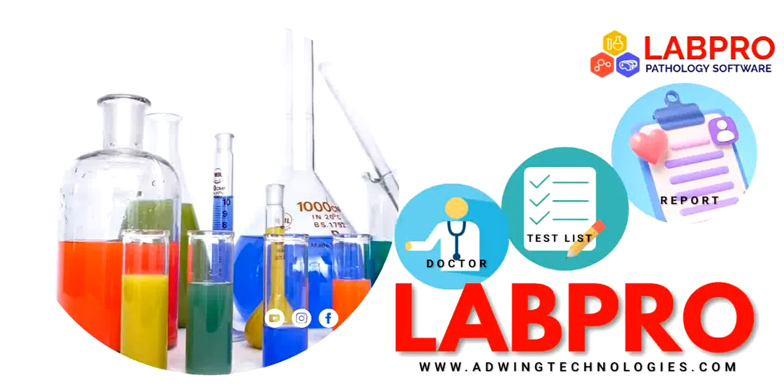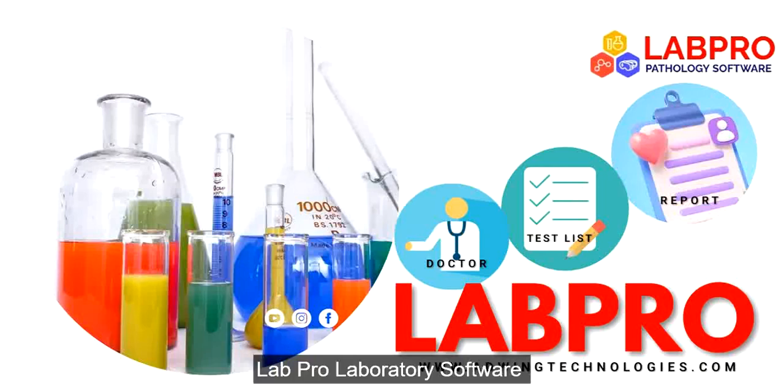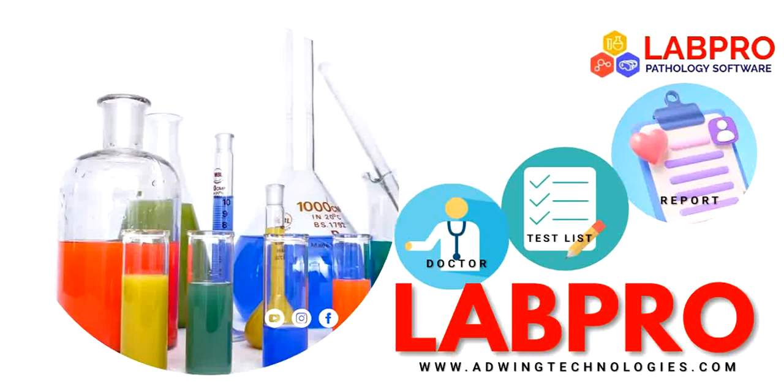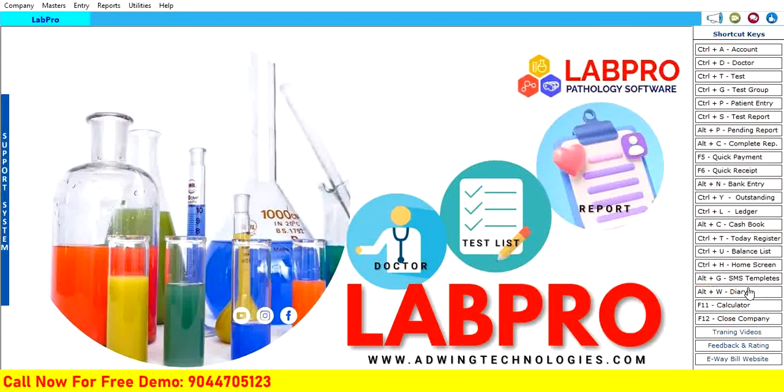This is LabPro, a new software. I am going to explain how to manage this software. This is a unique LabPro from Adwin Technologies, software for pathologies and diagnosis centers. It's very easy to manage. I'll let you know how to work on it.